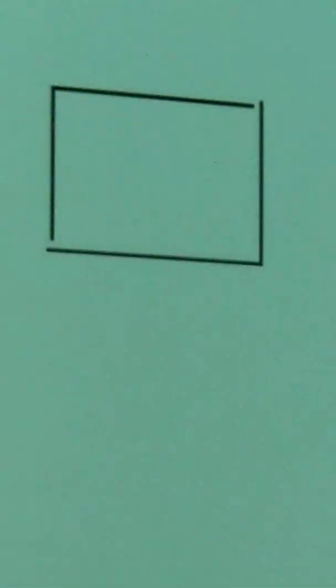This should be simple cuboidal epithelium. I really don't like this slide. Most of you will have a slide better than these. This is very pale, first of all. So that's what it looks like there.